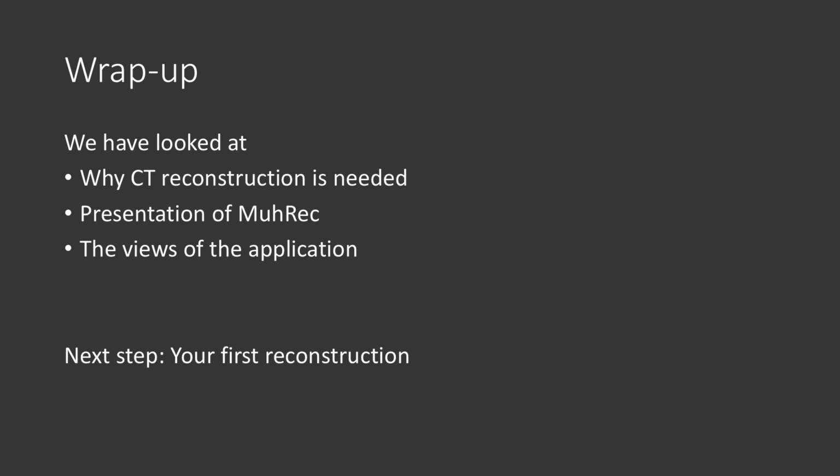In this tutorial we have been looking at why we need CT reconstruction and in particular the different components of the reconstruction software MuhRec. In this overview we didn't go through the steps you need to reconstruct the projection dataset. This will be the topic of the next tutorial.